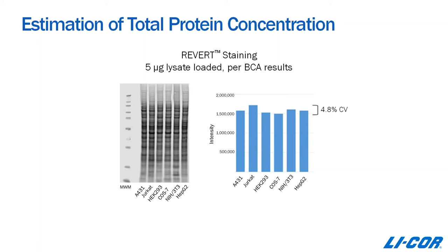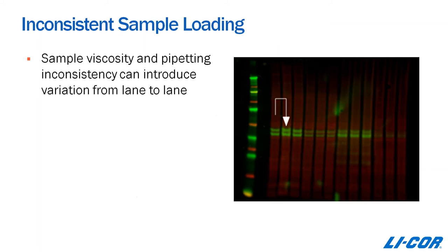Another issue that occurs, and I'm sure this is something everybody can relate to, is when loading a gel you sometimes get sample that spills over from one well to the next. This can be due to an air bubble or differences in sample viscosity that might push sample into an adjacent lane — which is exactly what you're looking at here. This isn't possible to eliminate entirely, but you can identify this variation by running replicates and use normalization to reduce the effects of this type of variation.